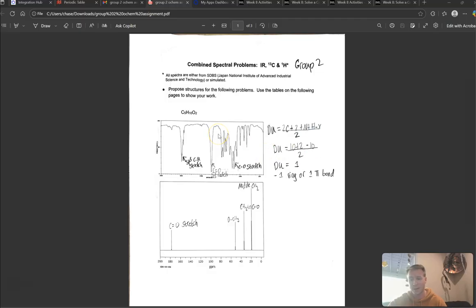So our first group we're going to look at is the infrared spectrum. The most obvious thing that everyone should look for first is that there's no broad OH group between 2,500 to 3,300 inverse centimeters. Our first thing identified, our heaviest group, is going to be between 2,850 and 2,950. It's going to be that sp3 CH group. Our next identification is going to be between 1,700 to 1,750. It is going to show that carbonyl stretch, that C double bond O.